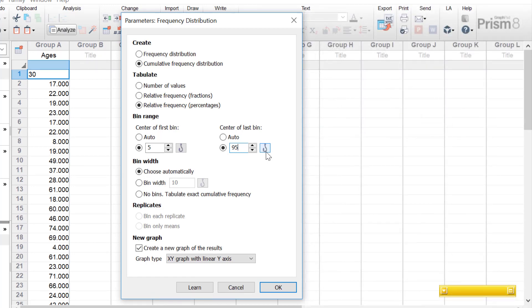Another important point: when you have values on the border of bins — for example, if one bin goes from 3.5 to 4.5 and the next from 4.5 to 5.5 — a value of 4.5, which is technically in the middle, will end up in the second bin, the one that goes from 4.5 to 5.5.